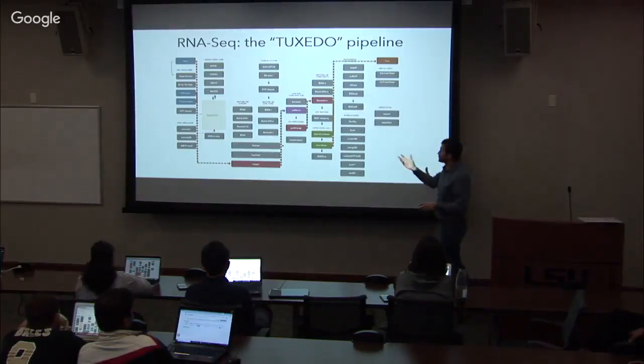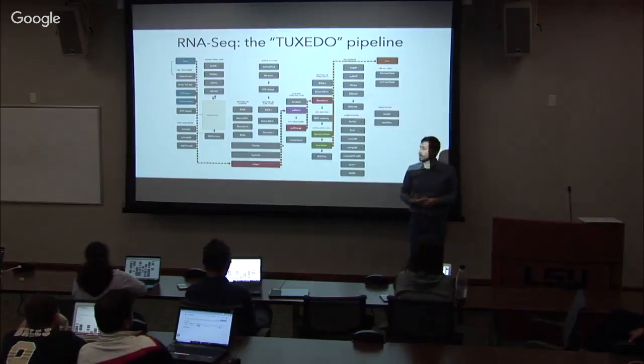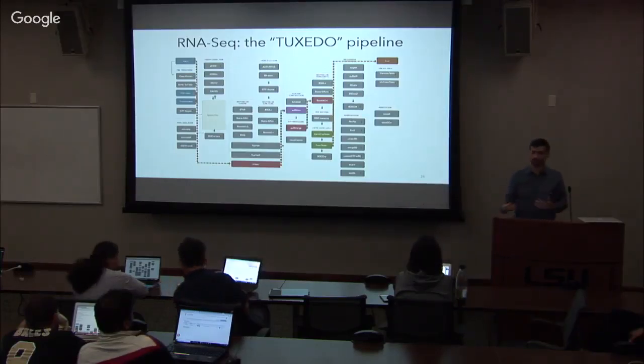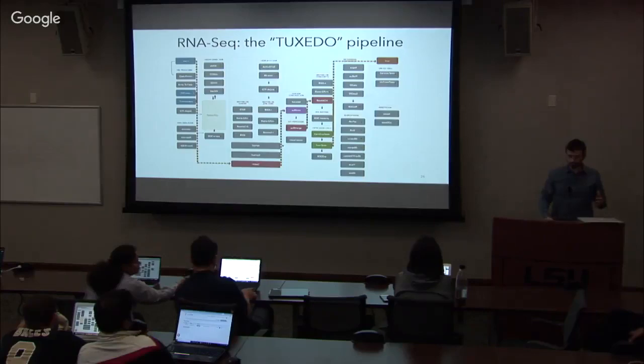And then afterwards, of course, you still need to quantify the levels of expression. Quantification could be of the actual transcripts and of exons. So if you're interested in differences between exon expression, that gives you a little bit more of a detailed view. So this is an expanded pipeline.